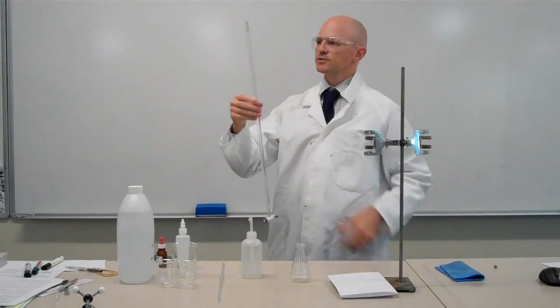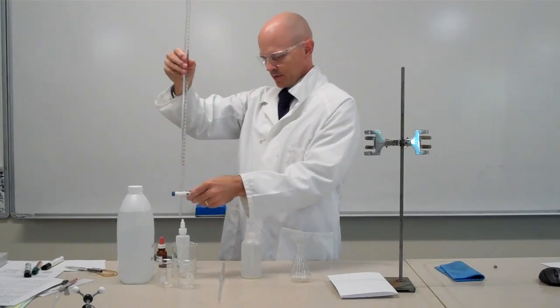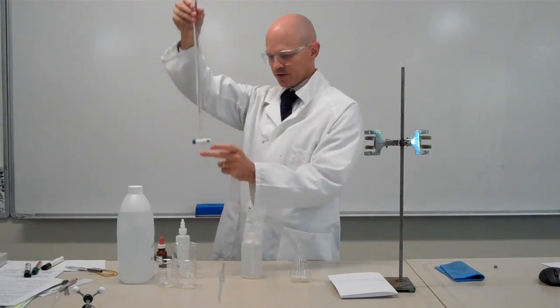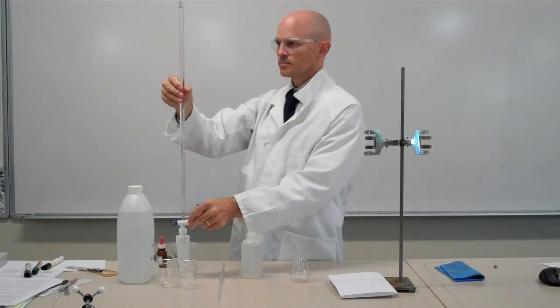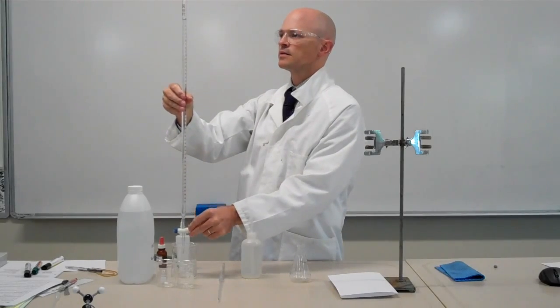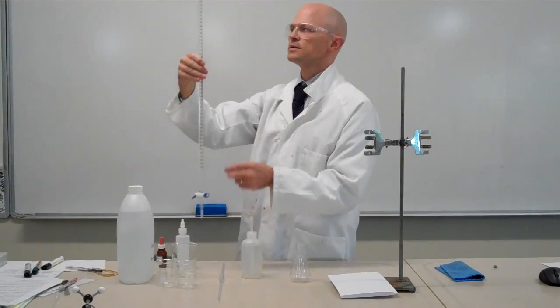Now I've had just a little bit too much. I'm over the zero mark. I'm going to wash some out. You also need to make sure that you don't get any air bubbles in the bottom of the burette. So I'm just draining that out. So it's just below zero.